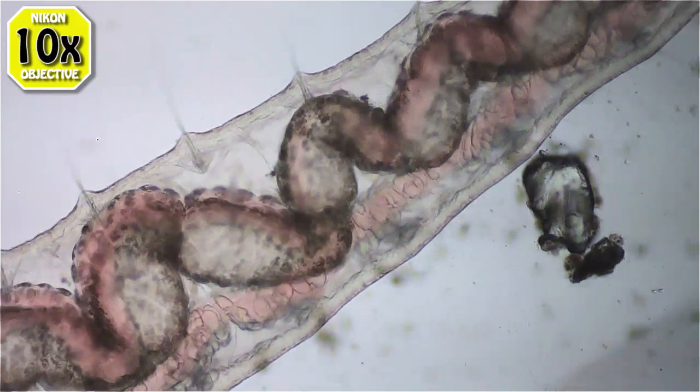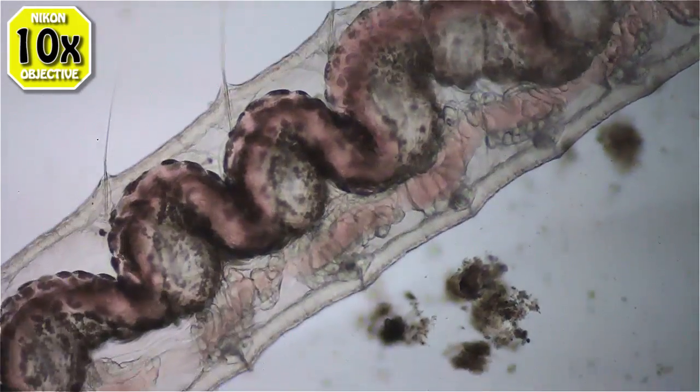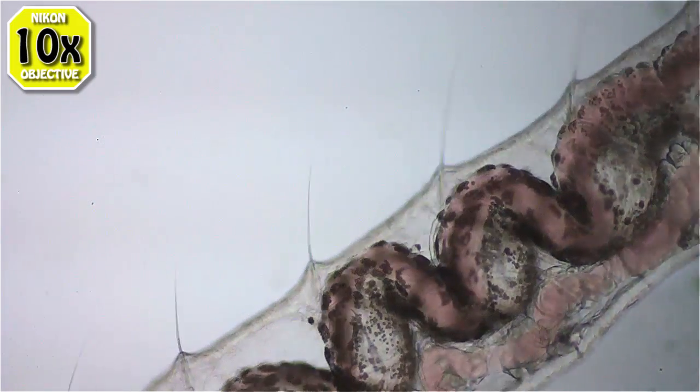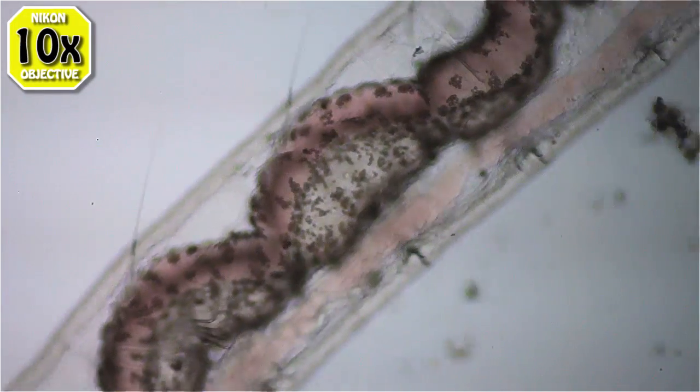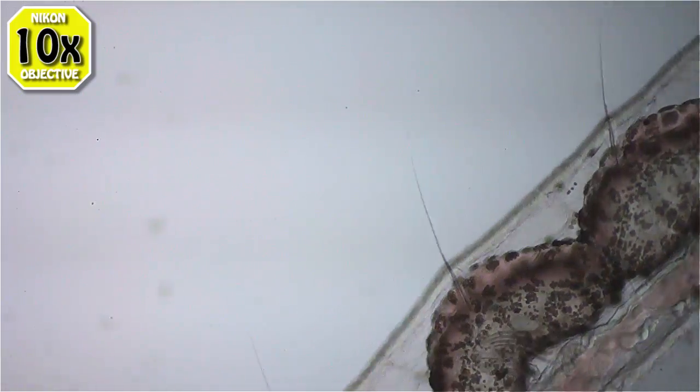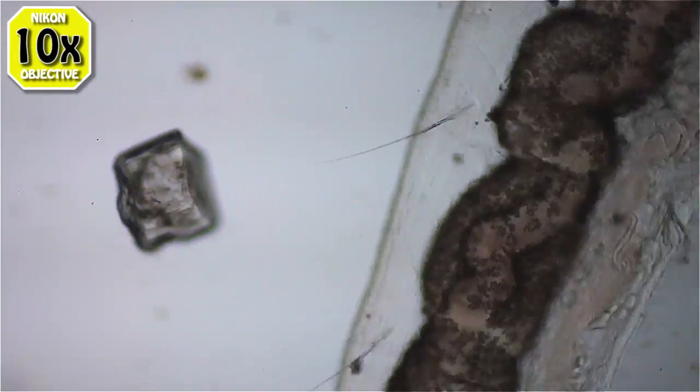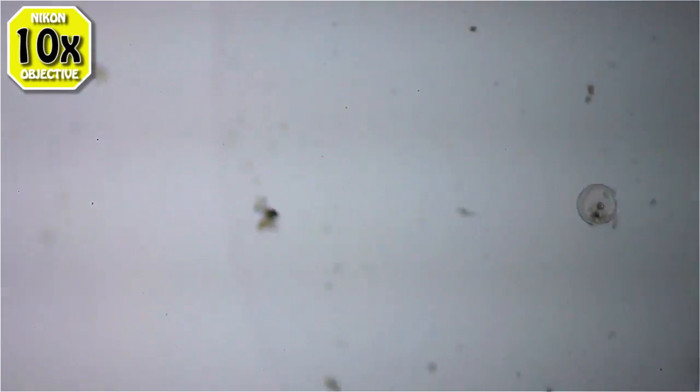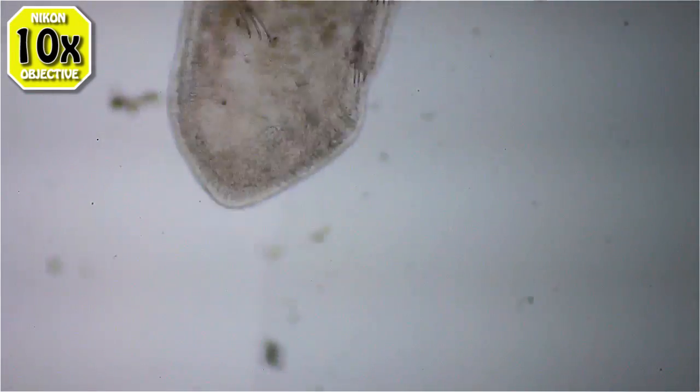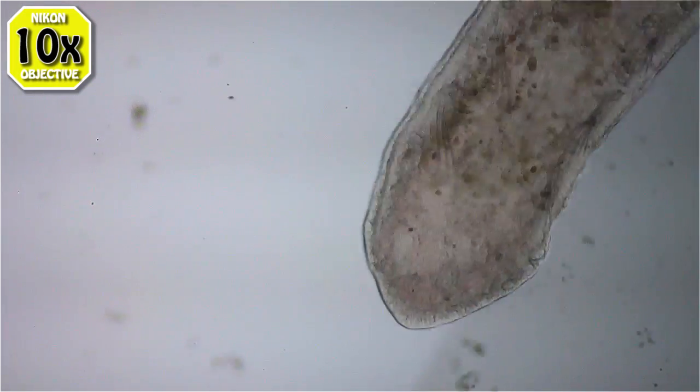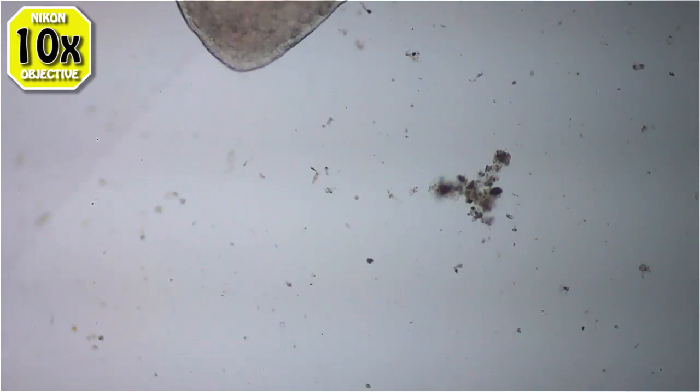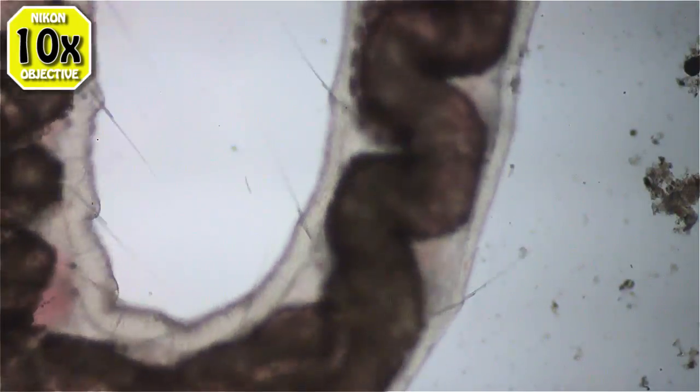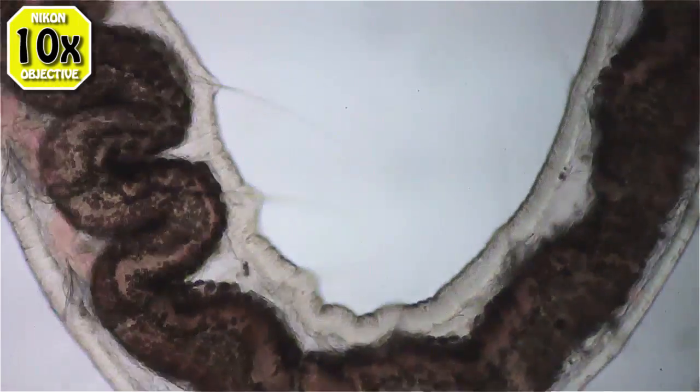I'm using a Nikon 10 power objective lens which makes it effectively 100 power by the time it hits the camera. I'm trying to find the head. There's the head. Very hard to see. I guess he has some sort of eyes or light sensors because he doesn't like the light. He's moving away from the light.